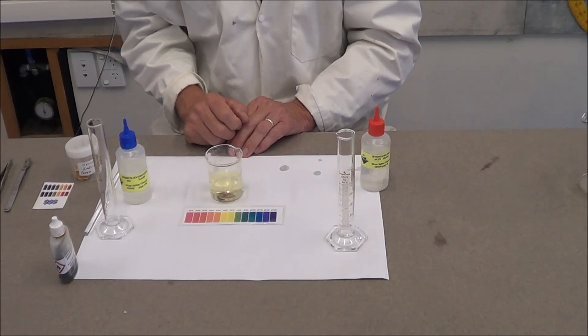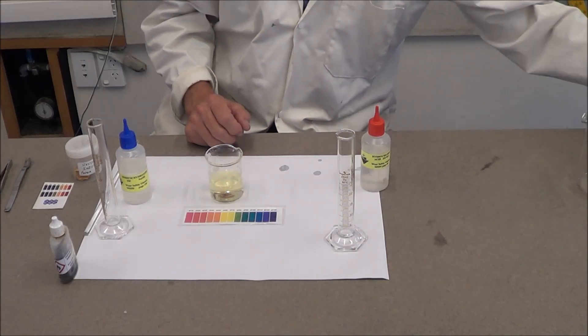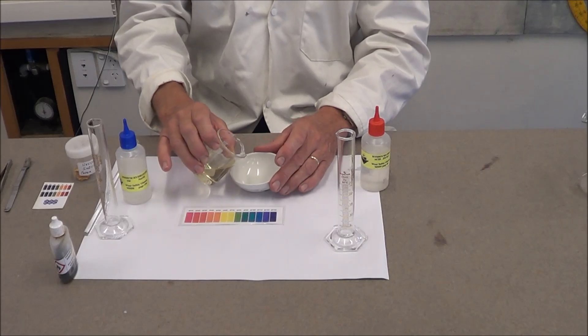To get our solid sample of the salt that's formed, we'll need to place this into an evaporating dish and place it over the heat and boil it for one minute.